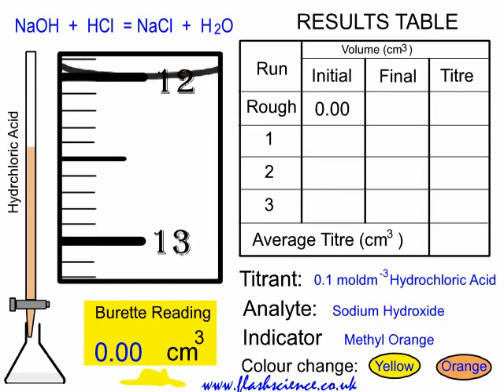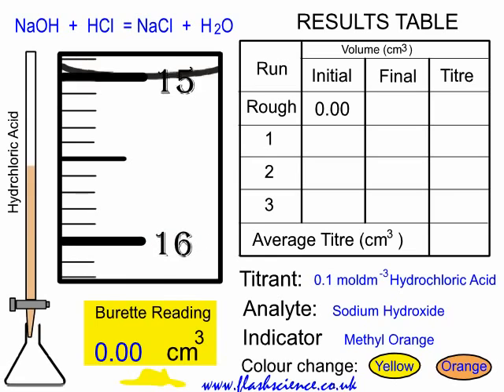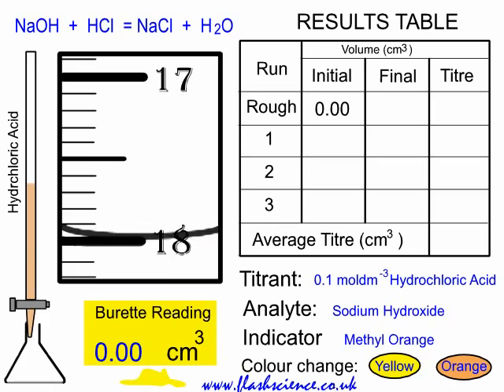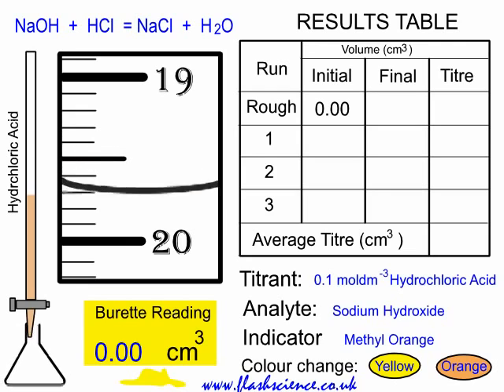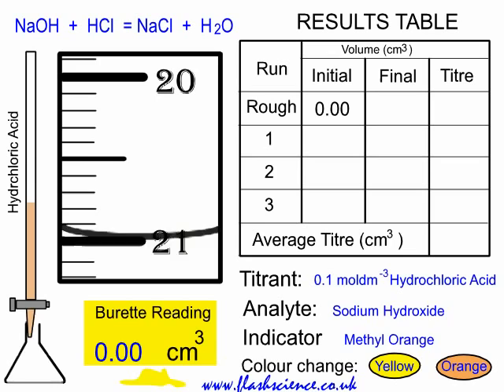Over to the left you can see the hydrochloric acid being run in — the stopcock has been opened, and I'm just rushing in the hydrochloric acid at this stage. We don't know how much it's going to take; all we're looking for here is a ballpark figure. Is it less than 10, more than 10, possibly more than 20? We're looking for a colour change from yellow to orange. 19 is in, coming up to 20 — just rushing it in, shaking the flask all the time.